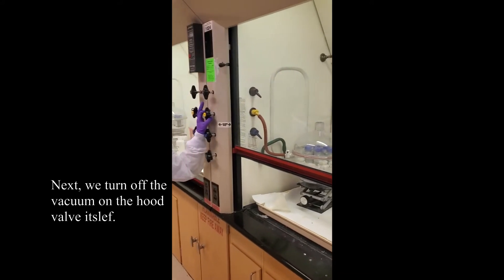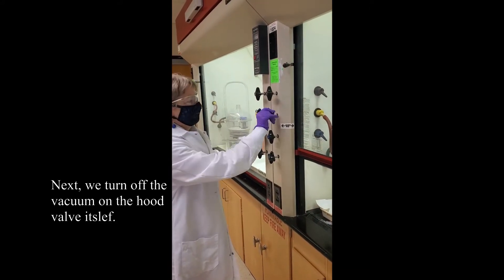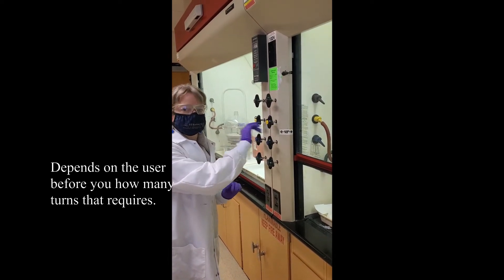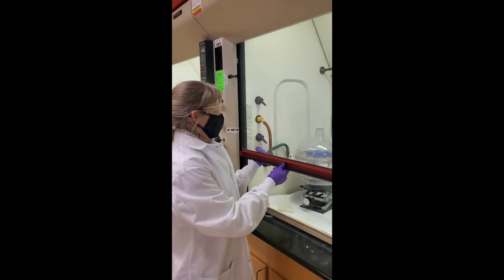Next, we turn off the vacuum on the hood valve itself. It depends on the user before you how many turns that requires, how strong they are.